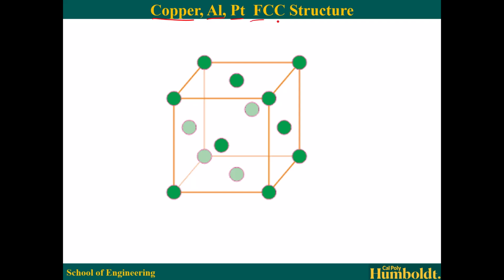Those all have an FCC structure. So in the XRD data that we are given, these are some potential candidate materials. So these are all the suspects.